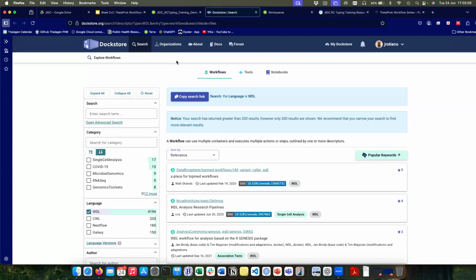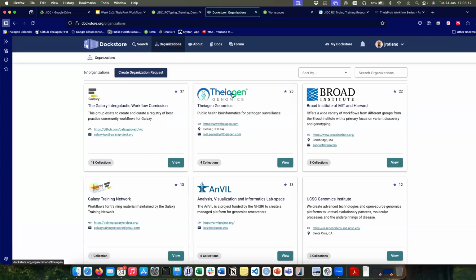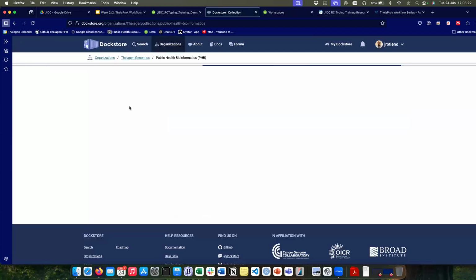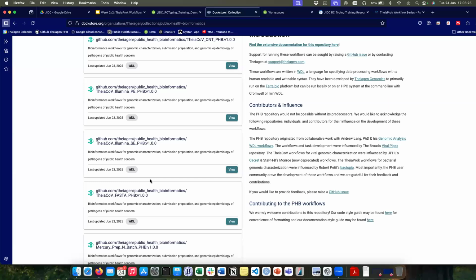So typically what I do is I just go here to organizations. Under organizations, I look for Theiagen. And then it will give me a list of collections. The one that we use is the PHB. And you'll see now we have a long list of workflows that Theiagen has developed.